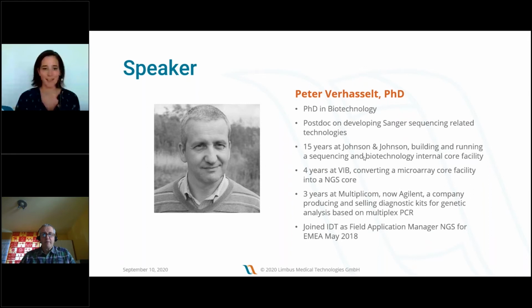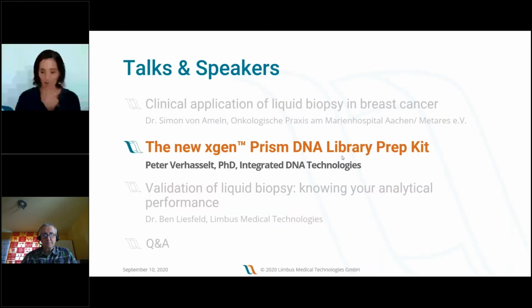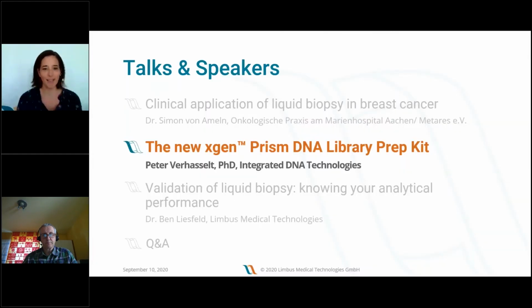So the second presentation is about the XGen, the new XGen Prism library kit by IDT. And we have here as a presenter Peter Verhasselt. Welcome, Peter. Thank you for joining us here today.